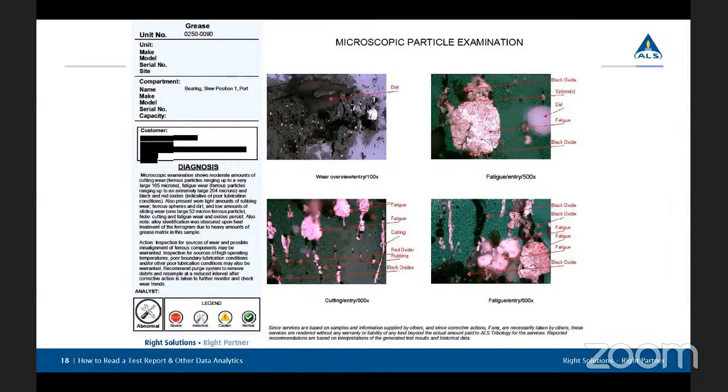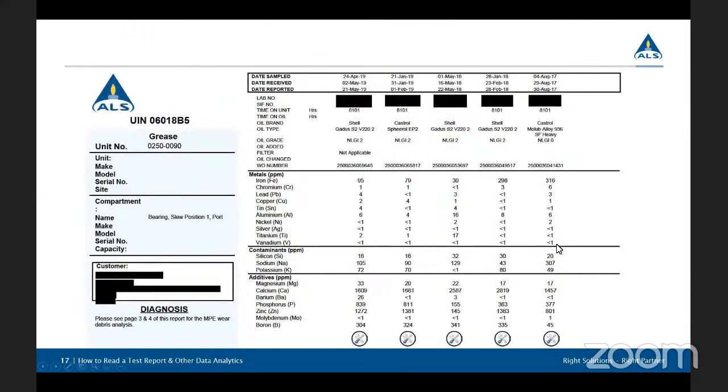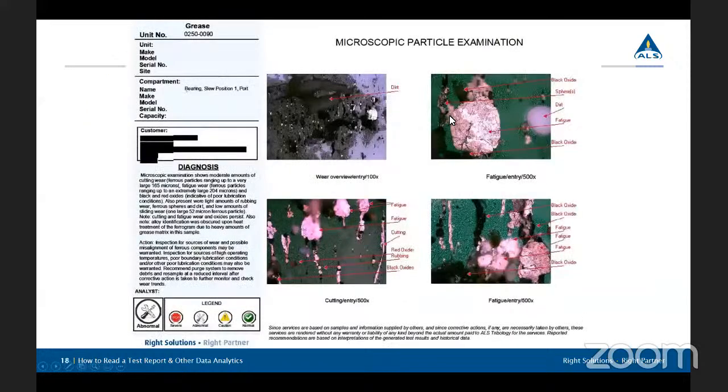Now, when we do spectrochemical analysis, we're really only looking at particles that are below maybe 8 microns in size. We're looking at very, very small wear particles that are being generated right in the beginning of those wear modes, where here we have a very accelerated wear going on. It's generating very large particles that are visible to the naked eye. Below about 40 microns, you can't really see with your eye. So the particles we're testing in the spectrochemical analysis, you can't see. These are microscopic. But here, these are particles big enough to see with your naked eye.